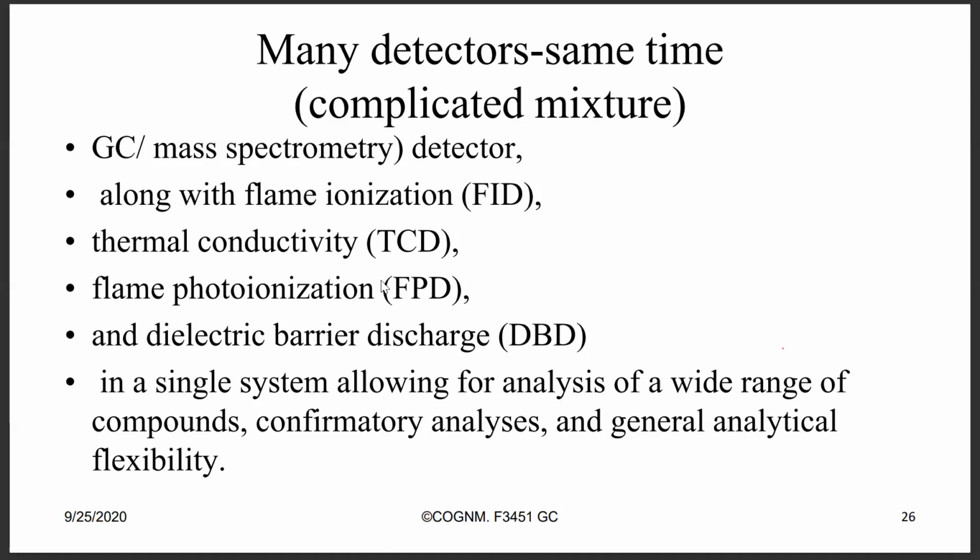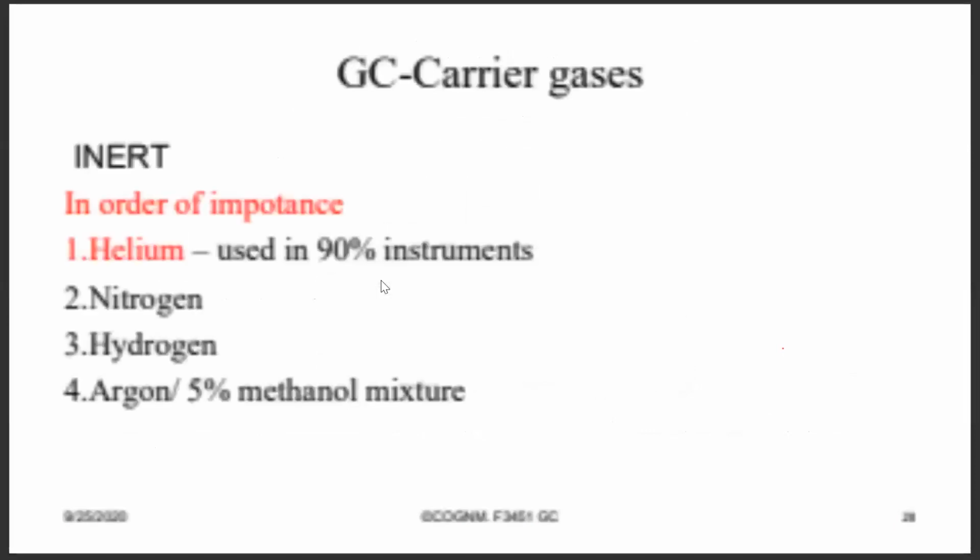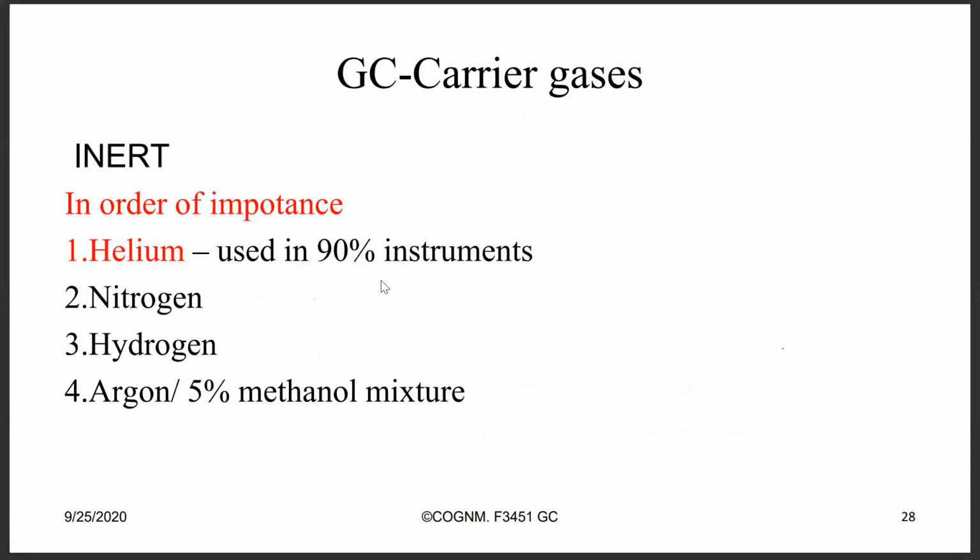For this now we have various detectors. So this is mass spec, and in terms of carrier gas, helium is the most used, about 90%.